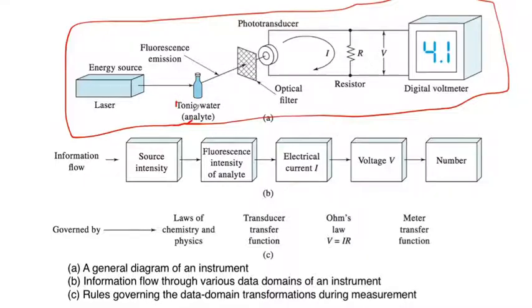The thing here though is we can change this. This is part of the instrument right now, but it can be removed or added. But the other things are pretty much static, especially in most high throughput instruments. You don't really have a lot of ability to change the stuff inside them. Maybe with older instruments, you could tinker with them and modify them a little bit if you wanted.